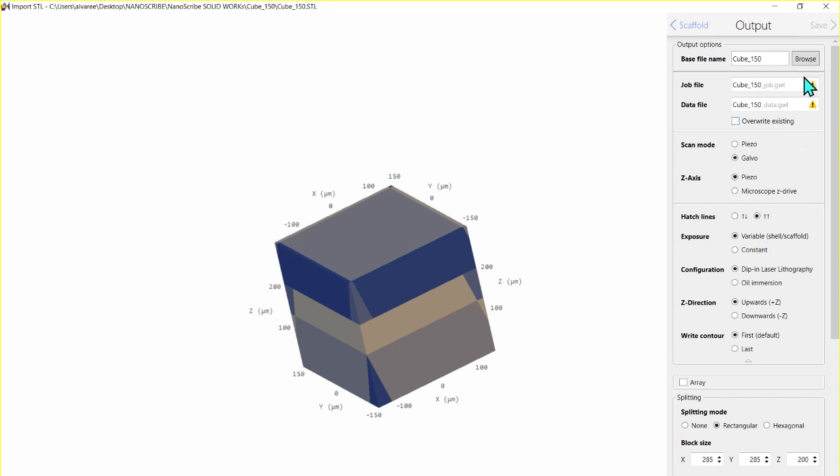First, also I want to show you this icon that you see here is telling you that there is a problem. The problem in this case is not important, it's that I already have one file with this name. So it's telling me, Erika, this file already exists. Do you want to overwrite? And if I click here, I say yes. So I will overwrite. It's just telling me that there is a problem and I need to pay attention.